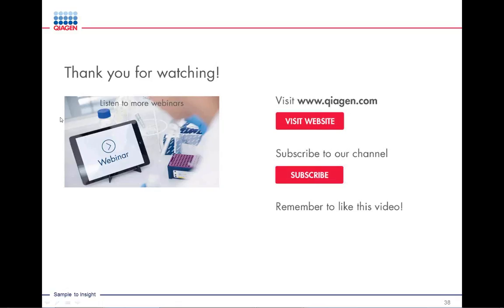How many probes are present for each transcript? We don't use probes. So just to clarify, these are primers. They're not probes. And we only have a couple of primers per target. So only just two primers for each gene that you want to look at.